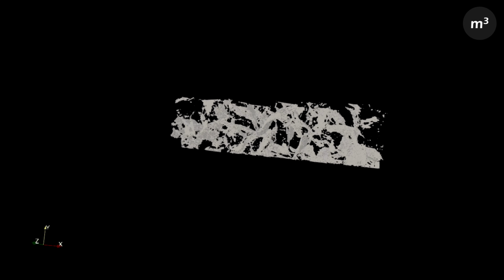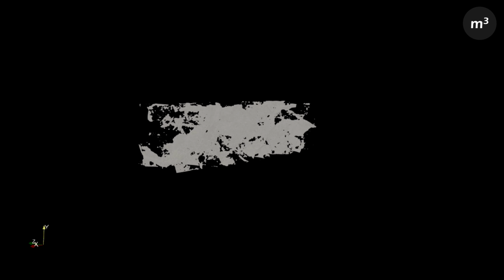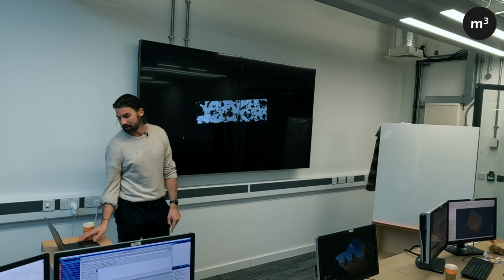We can now see the full hydride network and how that connects with the 3D microstructure. So this is stage one. And we also have the corrosion film on top, which is the next stage now, where we're trying to look at what happens when you corrode these hydrides, because we know they are bad for corrosion performance as well. So that's kind of where we're at with the 3D characterization at the moment.